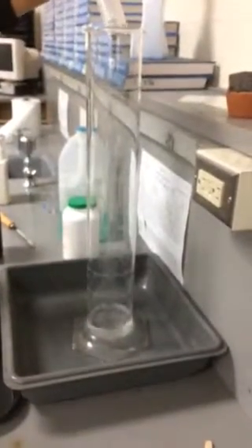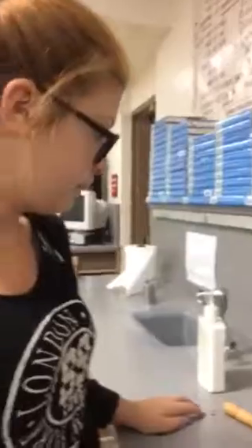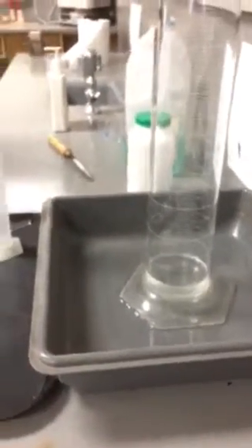There we go. Now, hydrogen peroxide will spontaneously produce oxygen, but you don't see any bubbles here. Okay, if you look at this, no bubbles. Well, guess what? Bubbles are forming. Oxygen is being produced, but it's just not fast enough for us to see the bubbles. So what we're going to do is capture them in some soap solution. Now the soap solution itself is not going to start anything. That's the soap solution.